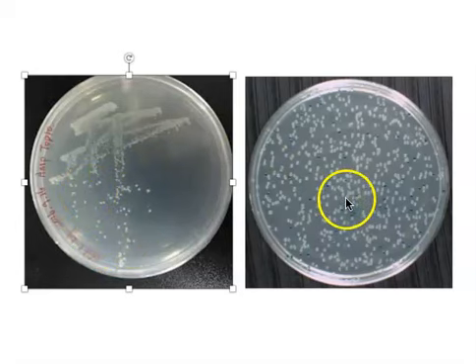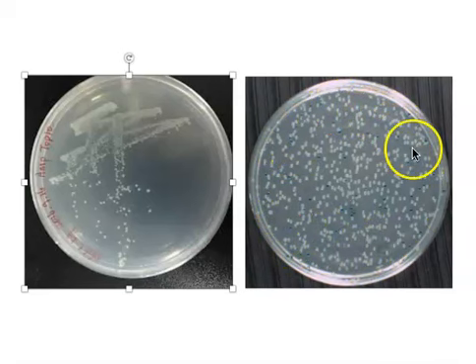The purpose of making a spread plate, in comparison, is to make a plate that we can use to actually count the colonies and then apply a little mathematics and get an estimate of how many cells were in the original sample.